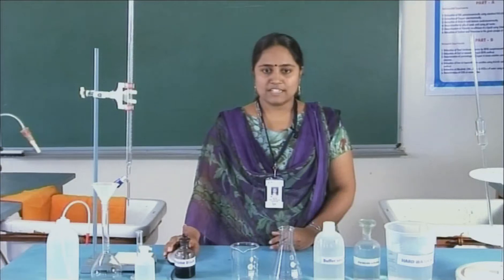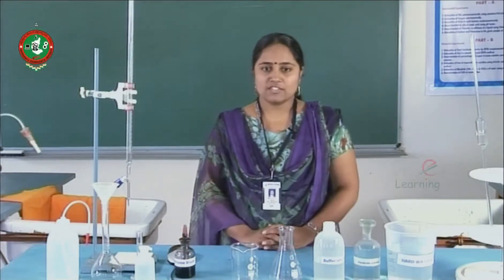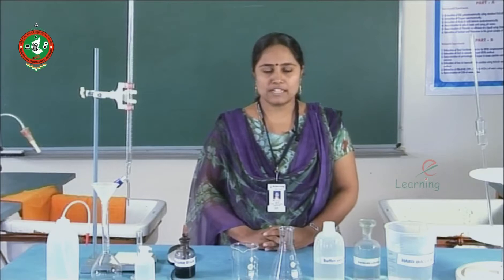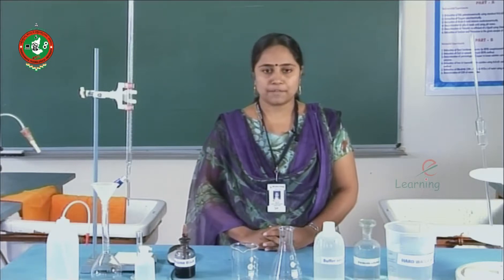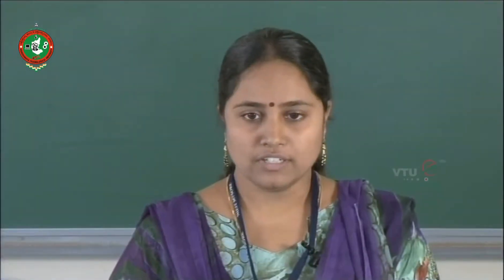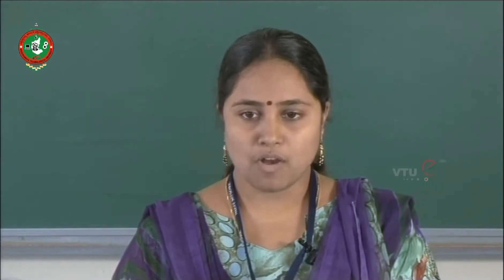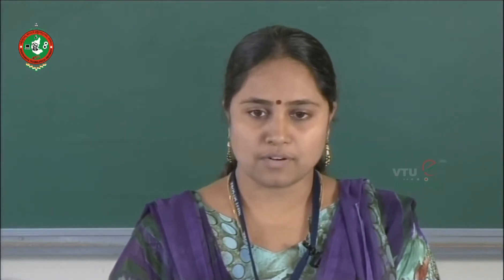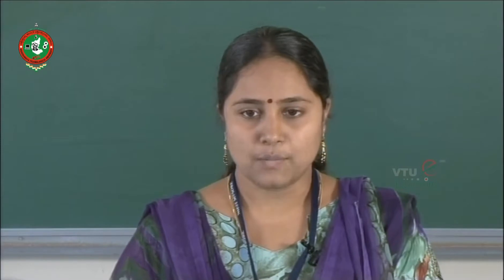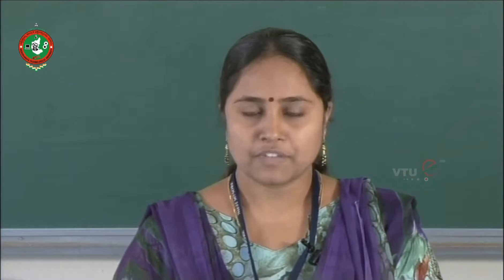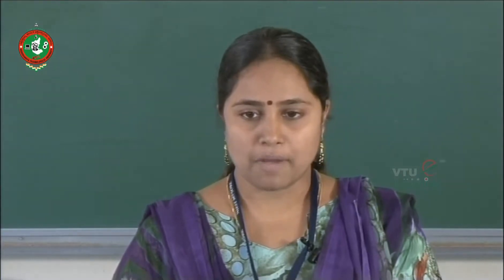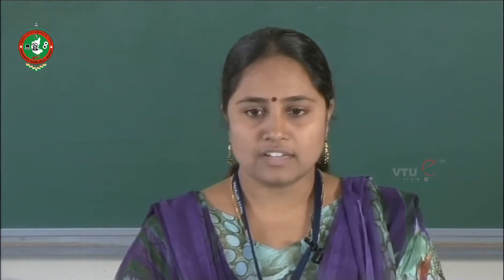Hello students. I would like to start with general instructions to be followed strictly while carrying out experiments in Engineering Chemistry Lab. Let us know how to wash a burette. Wash the burette thoroughly with tap water, then rinse it once with a small quantity of deionized water. Now rinse it once with about 10 ml of the solution to be buretted and reject the solution. Fill the burette beyond zero mark using a funnel and adjust the meniscus to zero centimetre cube.